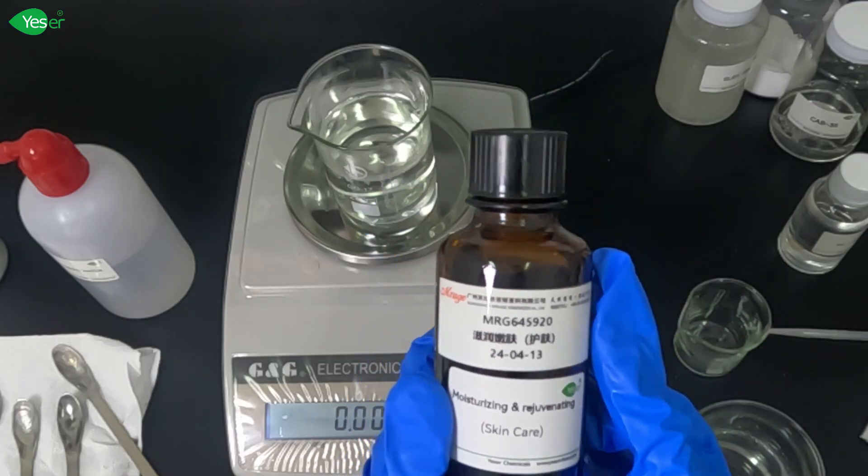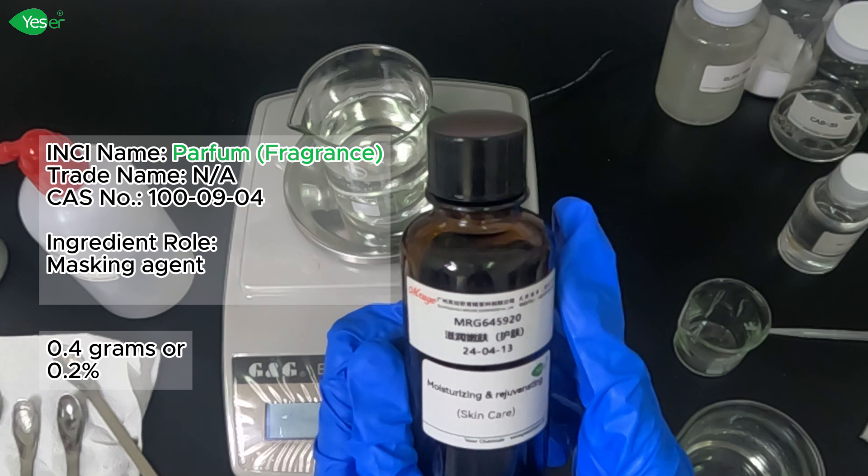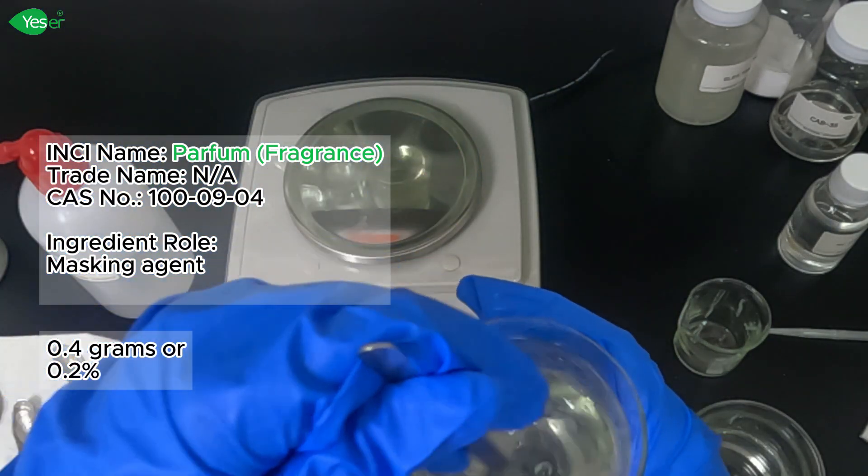Now let's add our fragrance for this formulation. We'll add about 0.4 grams of our fragrance, 0.2% for our formula. Stir this well until it is fully incorporated.